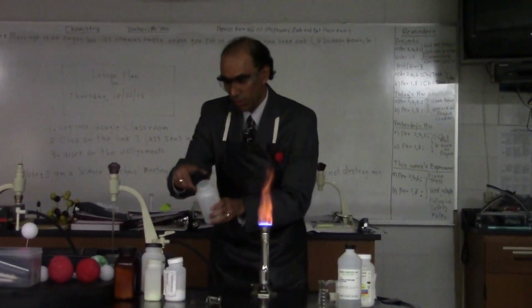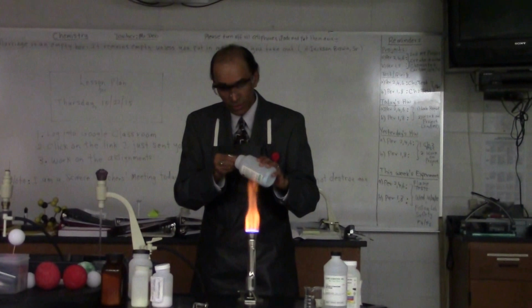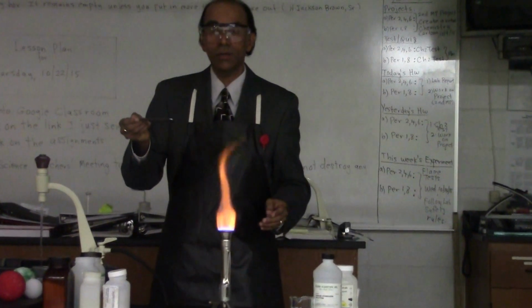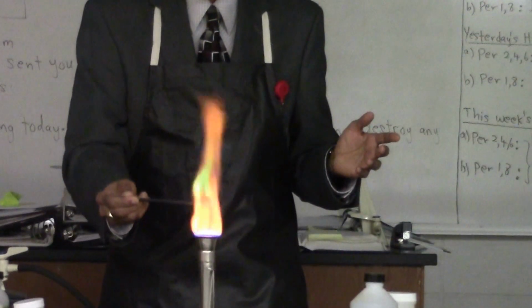And the second experiment has to do with copper sulfate. So I'll take a small amount of copper sulfate, and copper sulfate is blue in color, and I'm going to hold it in the flame, and let's see what's going to happen when I hold it in the flame.